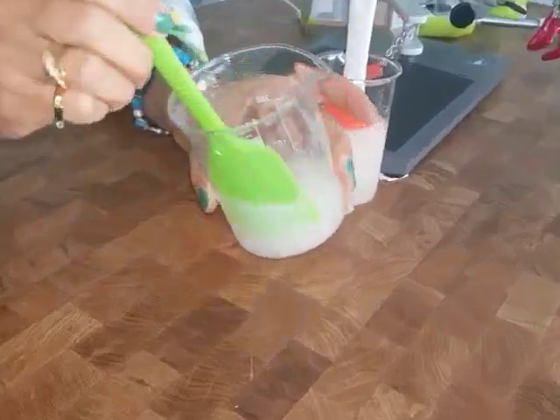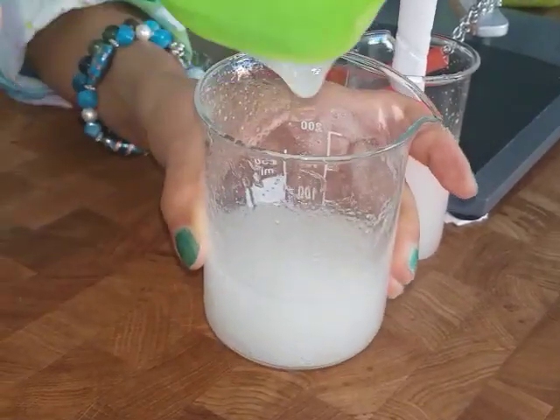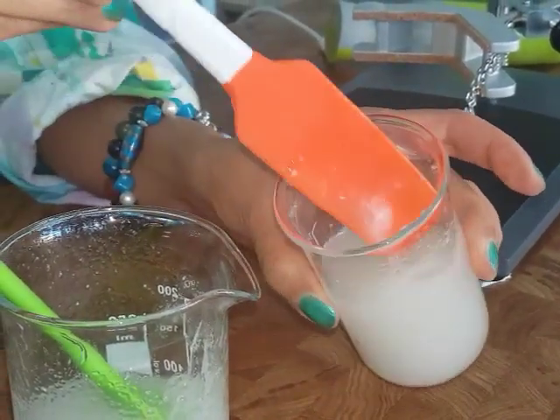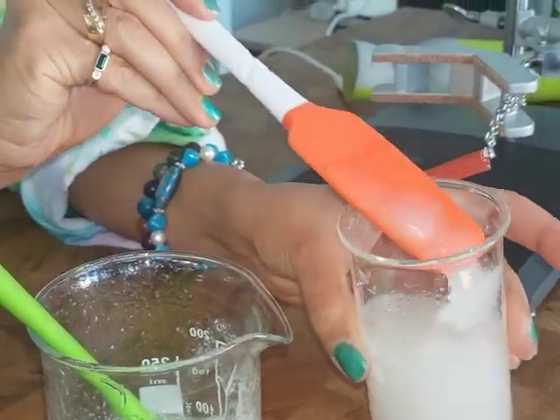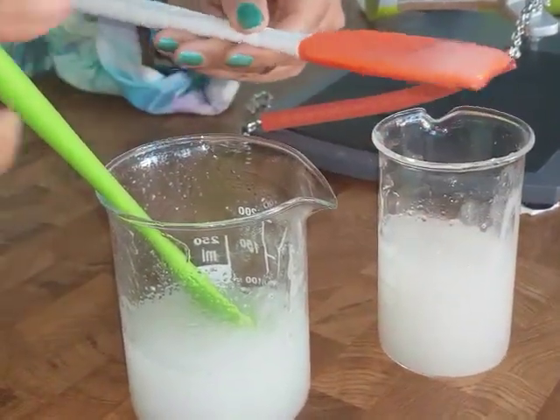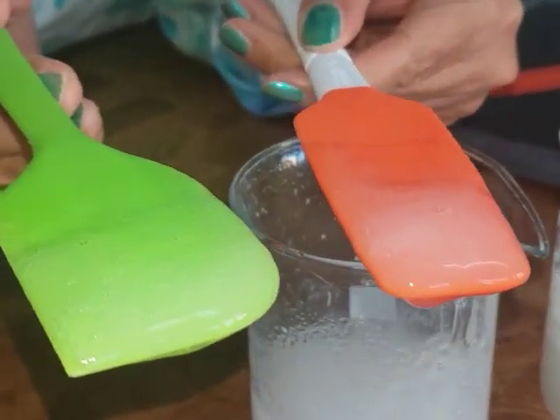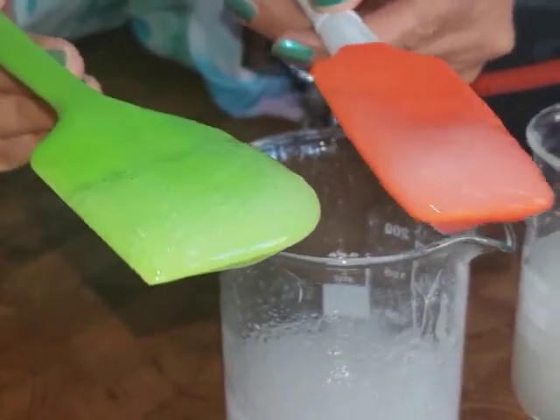There are air bubbles in there, but the rest is quite smooth and nice and it did a pretty decent job in a very short time. This is how Blendia looks — it has less air bubbles. It is maybe because I have less experience with the Dynamix, but obviously Blendia has less air bubbles and Dynamix has more. But from smoothness they are absolutely the same, and Dynamix did it faster and with less struggle.